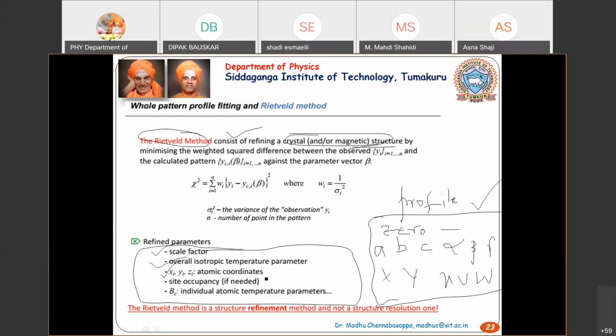That is your atomic positions of your atoms. We will also change the occupancy, and also the B-iso. B-iso is nothing but your thermal parameter. As I told, even at room temperature, which is 300 Kelvin, your atoms will have small vibrations. This is taken care of by your B-iso in your model. So all these things we are going to change.